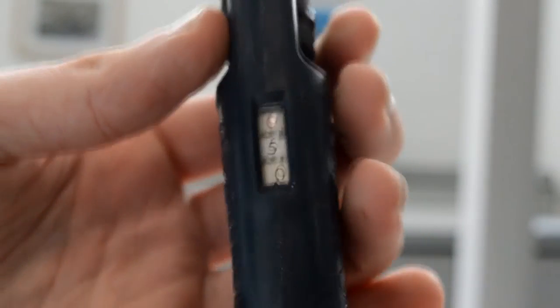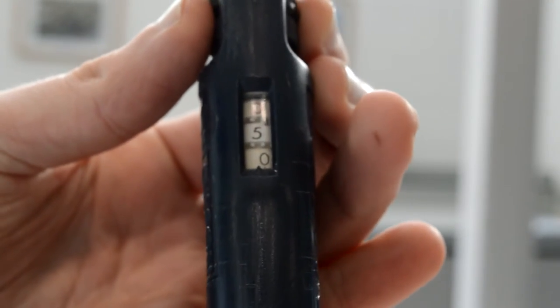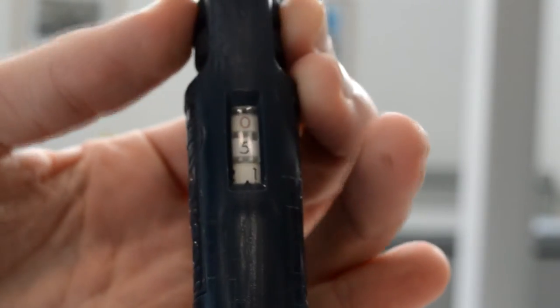So to actually use a micropipette, it's relatively simple. The first thing that you want to do is adjust the dial on the front by using either the cogs or the plunger on some newer editions to change the indicator to the volume that you want. You need to make sure you're using the right micropipette, otherwise you're going to get inaccurate measurements.